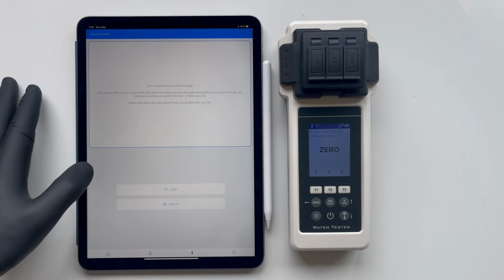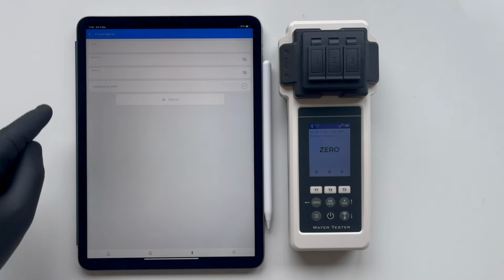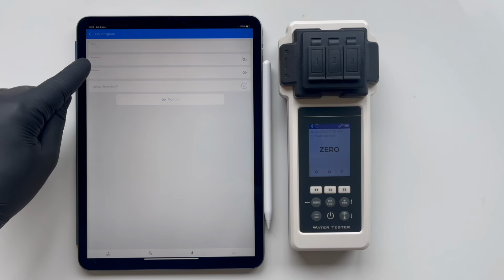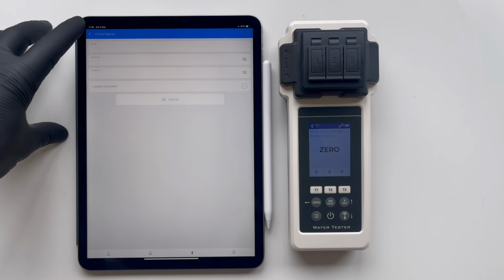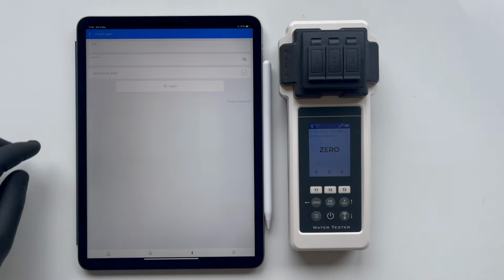Press Sign Up. At this point, you need to enter your email. Enter your password. Confirm the password. And press Sign Up. Your account will be created instantly. We already have an account, so we simply enter by pressing Login.